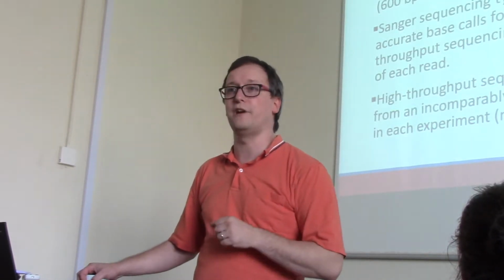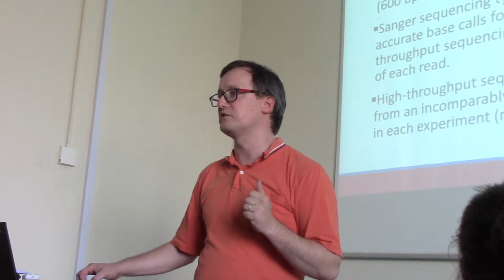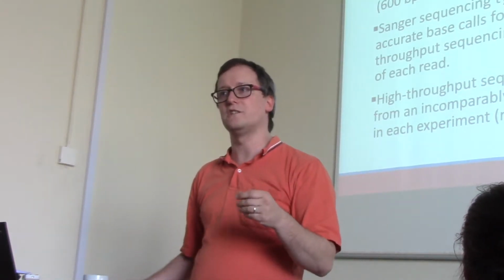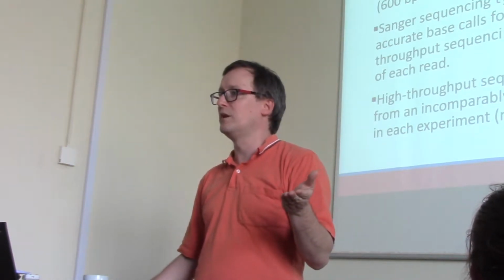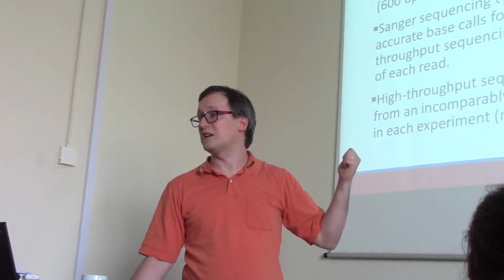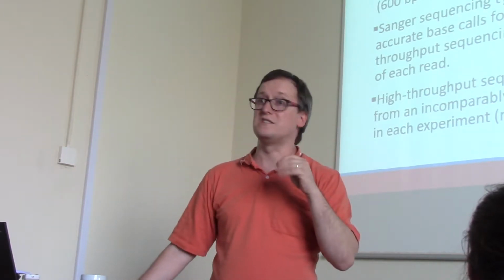So I showed you an electropherogram from capillary electrophoresis. I think you can see how you could translate those peaks and valleys into 500 or 600 base pairs. Most sequencers today, however, use short-read sequencing technology. That's not to say this is the only game in town.